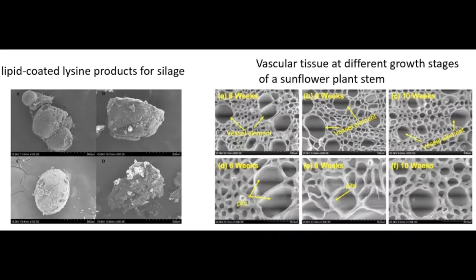These SEM micrographs are of biological samples. On the left is the lysine products for cattle feed showing surface structures. On the right you can see the SEM micrographs of the vascular tissue of a stem of a sunflower plant showing their growth stages.